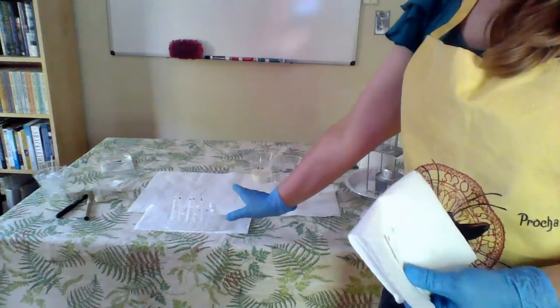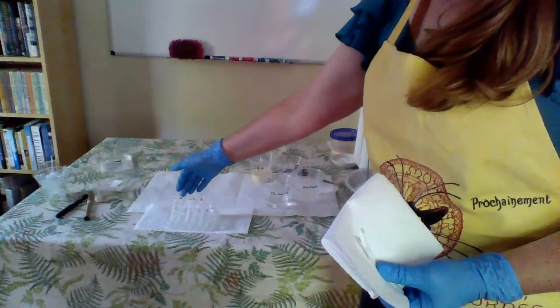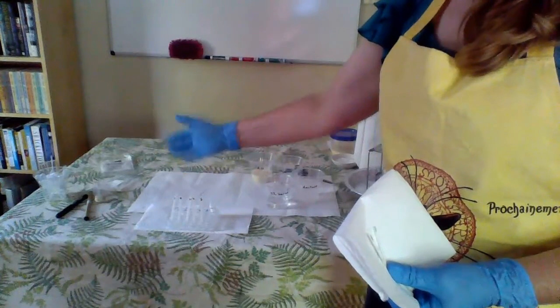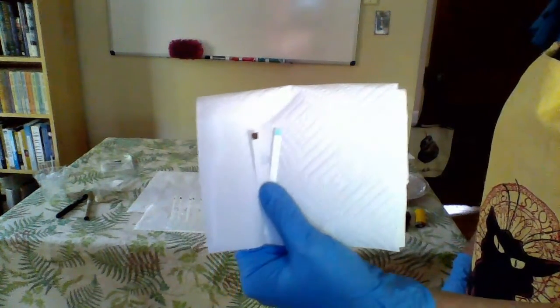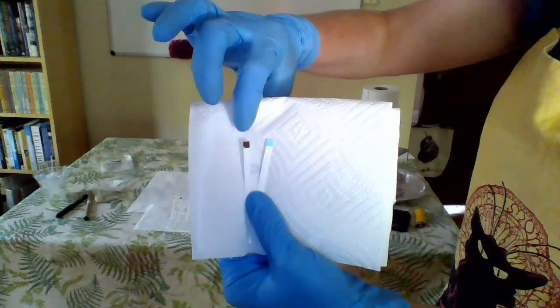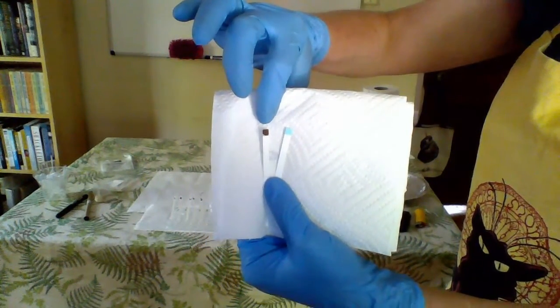So I've let my wells and my liquids set for the 5 minutes. The next step is going to be to take each of my glucose strips and just lightly dip them into the well. We don't need them to get too overly saturated with liquids. The liquid only needs to remain on there 5 seconds to start to get a color change. And what I have here is this little strip that I dipped in a very high concentration of glucose, and it immediately changed color.